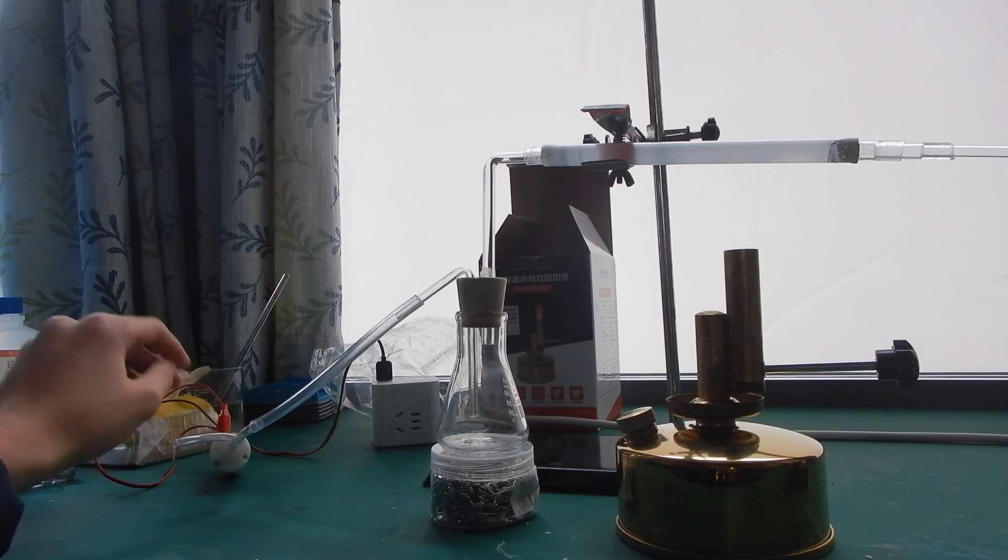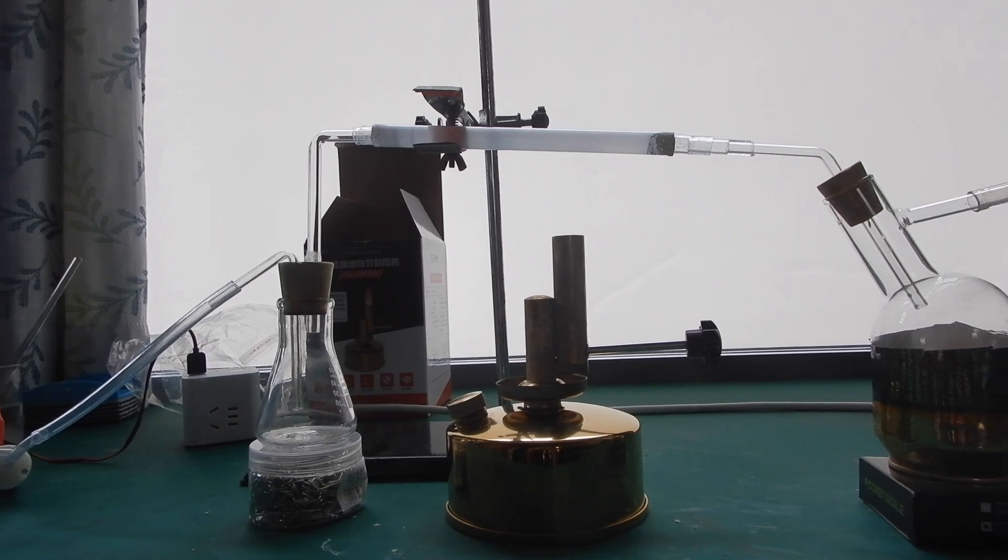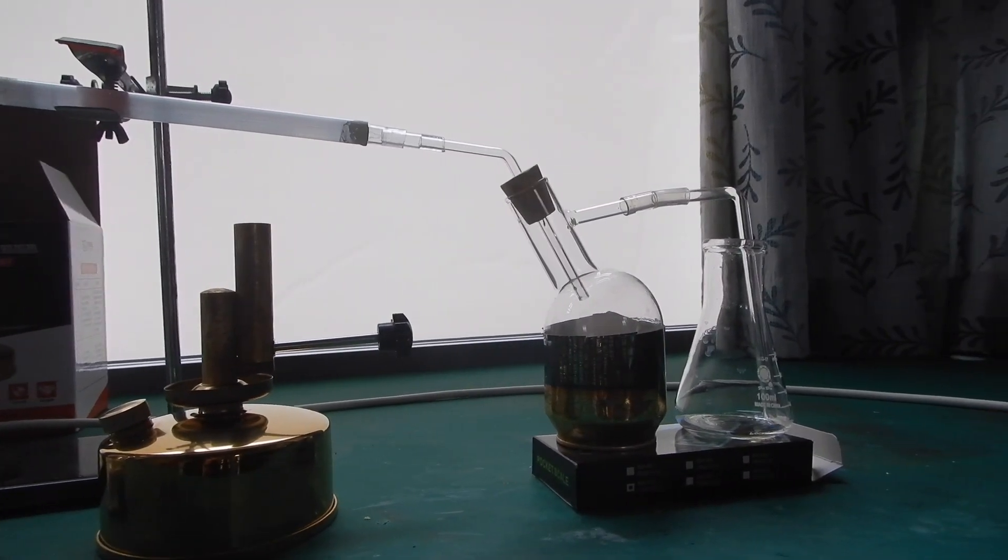Here is what the final apparatus looks like. After the quartz tube, there is a round bottom flask for oxidation, and finally a conical flask to absorb the product.